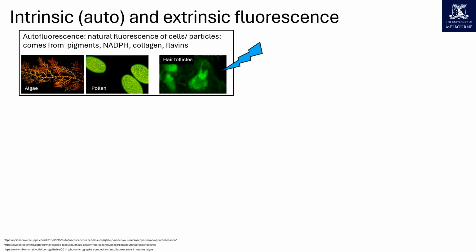Biological particles, including pollen and mammalian cells, have a level of natural fluorescence caused by molecules in their makeup and their metabolic activity. In some cases, autofluorescence alone can be used to identify cells of interest, but in most cases, autofluorescence is not sufficient, and extrinsically added fluorochromes are required to resolve distinct cellular populations.